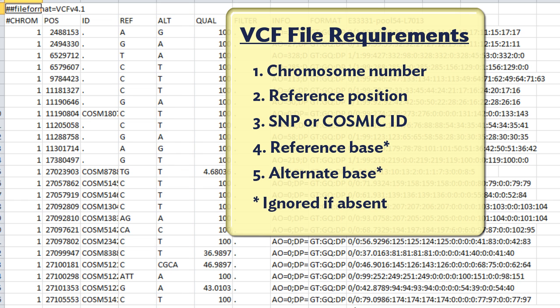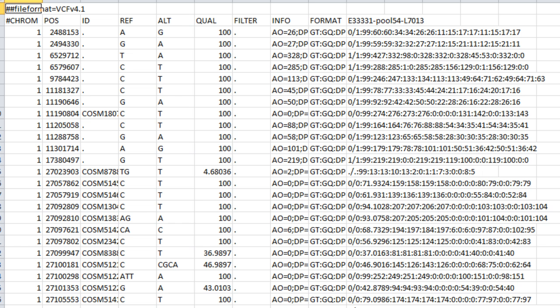SeekMan NGen will ignore these columns if they are not labeled Ref and Alt. Additional columns are not required for analysis, but they can be used to store annotation information.